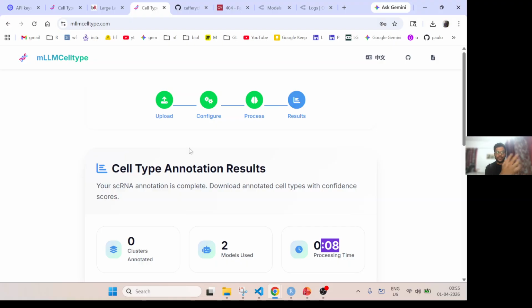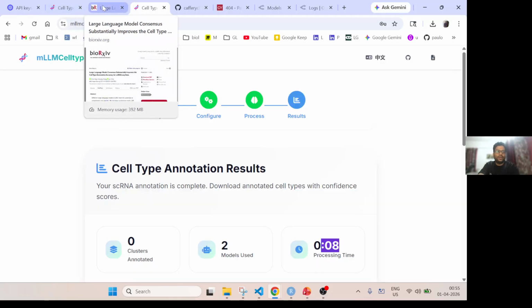You use them, get an output, then try the reference-based method to get an output, then use the LLM to assist you and give some scientific justification and knowledge behind those things. But ultimately, as a researcher, you should combine all three to come to a conclusion, and do the best case.